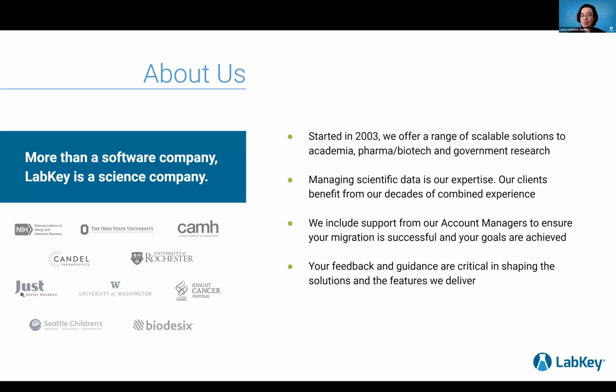With Sample Manager, we partner very closely with you. We help import your historical data, get your system configured the way that you want it, and we help train all the users that will be using that software. And then we also take your feedback very seriously. Our software is very dynamic and we're always growing. We actually have monthly releases with our software. So you're not going to get something that's outdated and won't be useful in a couple years. We're going to keep growing with you.